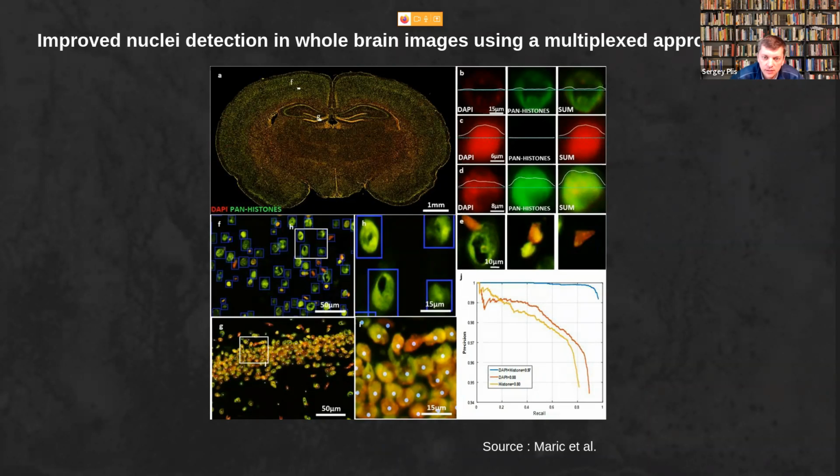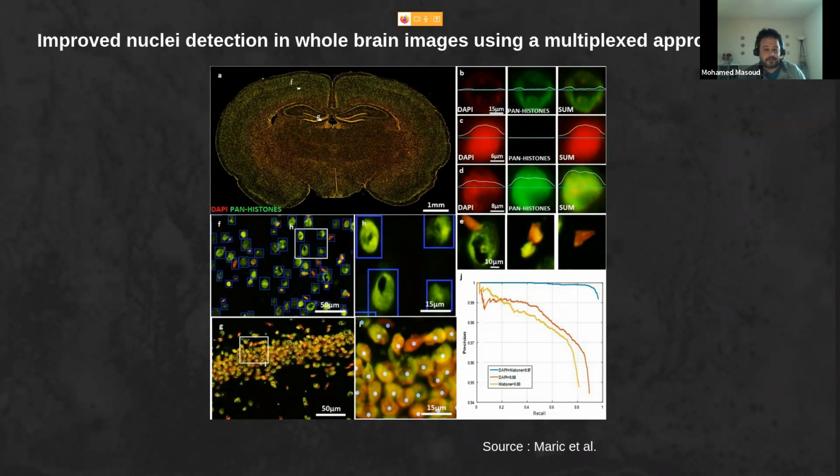So I have a technical question. You need to cut the slices of the brain, right? And after you cut the slices, are they trying to put the slices back into a 3D structure, or is it only looking at one slice at a time? Are they creating a 3D view of the whole structure of the brain?